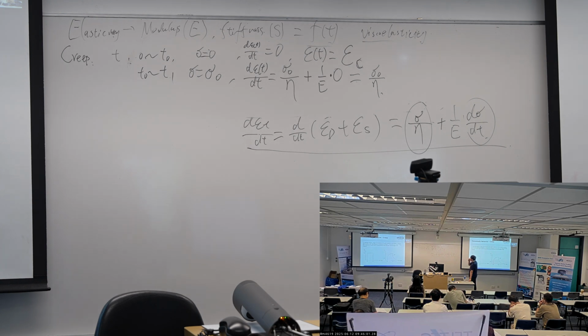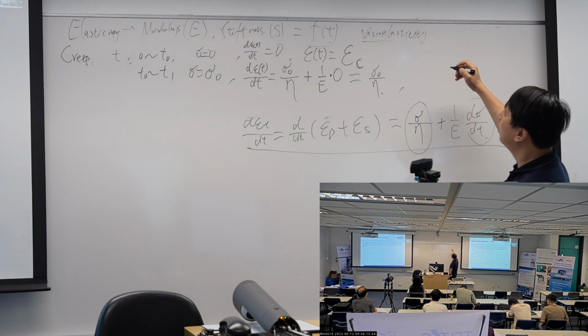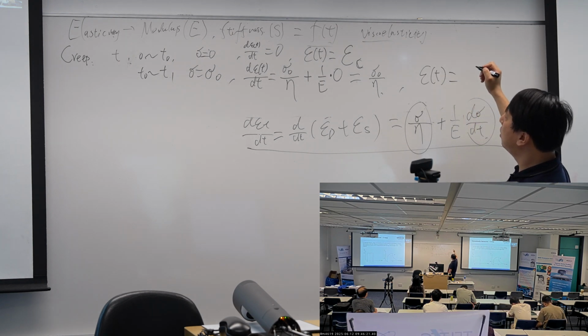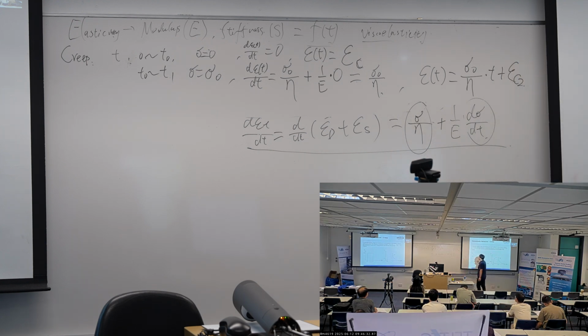Did I miss something? The epsilon t should be a time-dependent term plus a constant.